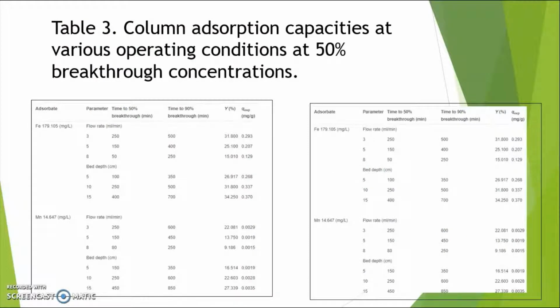And this is table 3, column adsorption capacity at various operating conditions at 50% breakthrough concentration. You can see here.